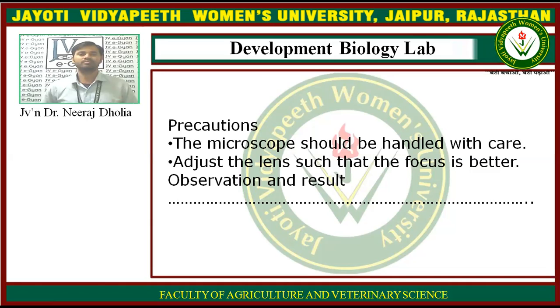So patiently you will focus on the various anatomical structures of the testis, and you will correlate with the anatomy you have studied. The microscope should be handled with care, because it is a sophisticated and delicate instrument. Adjust the lenses such that the focus is better, observe the images, take the images with the digital microscope, and put them as a result.